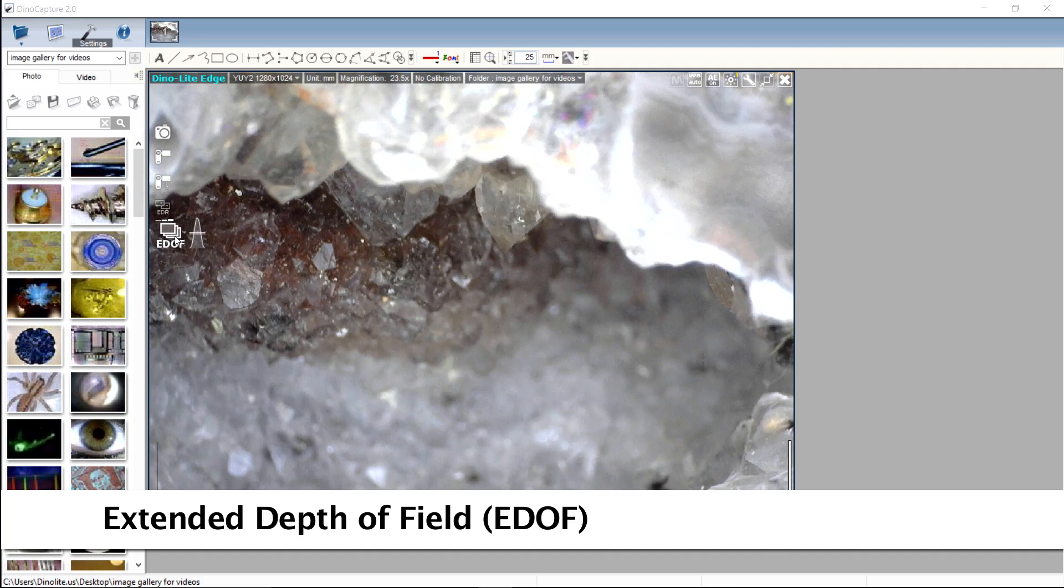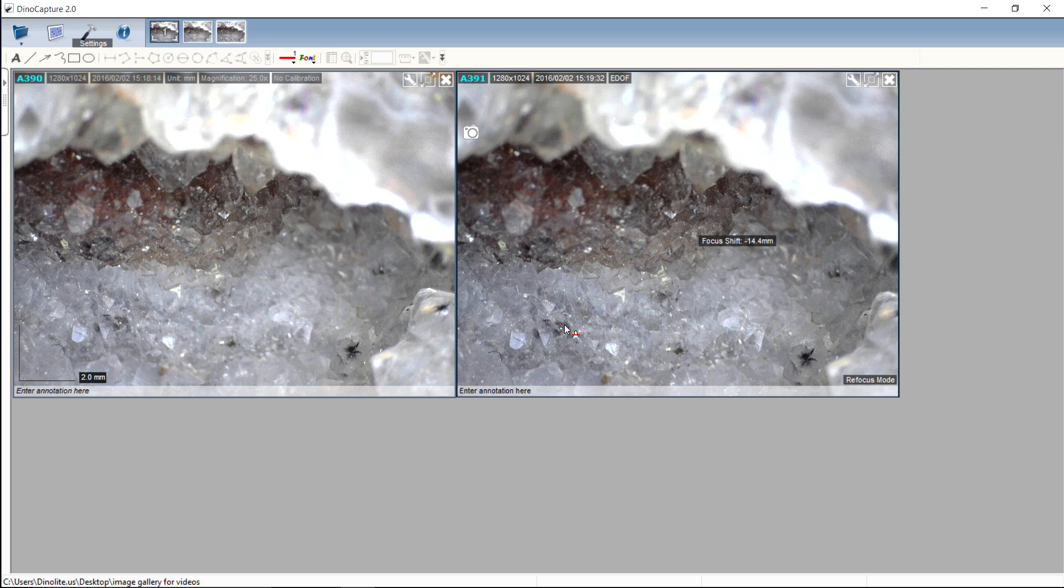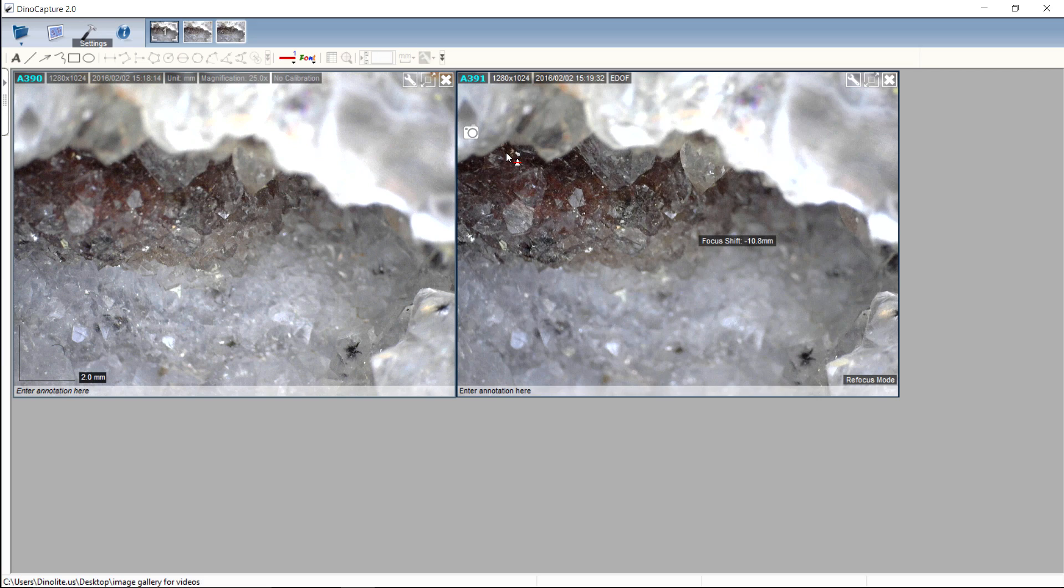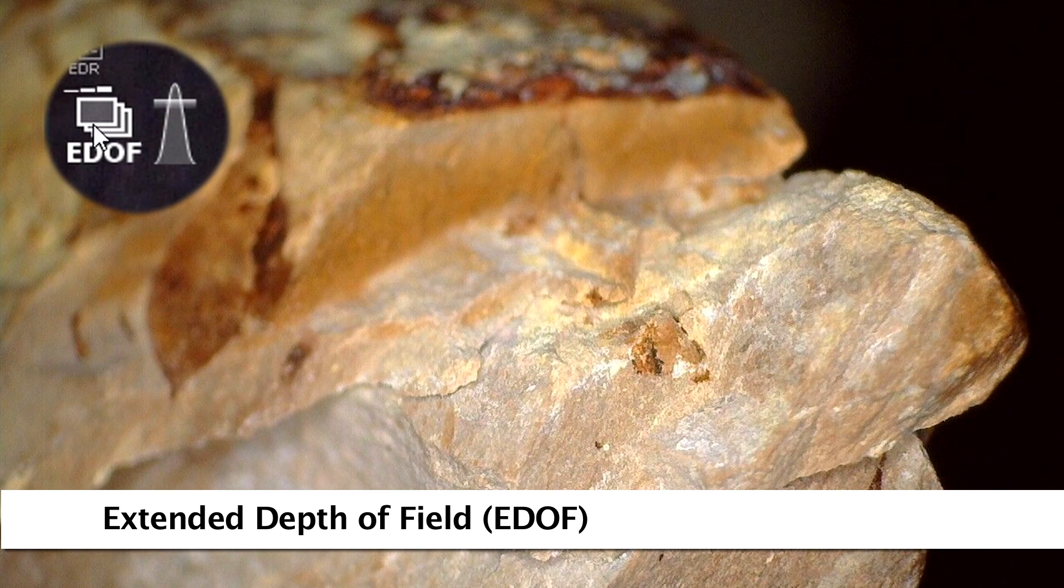EDOF models provide simple one-click focus stacking, capturing multiple images at different depths and stacking them into one clear image. These images can then be viewed or saved separately or as a clear single EDOF image.